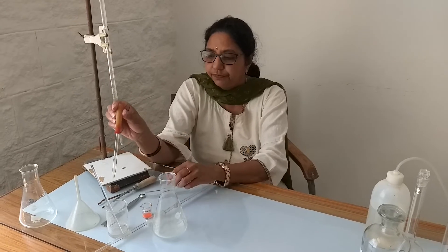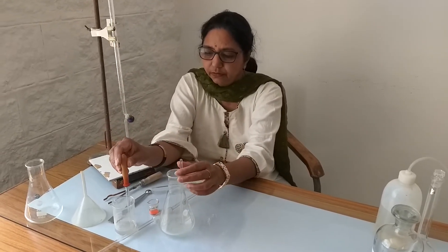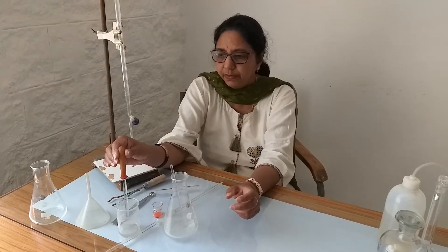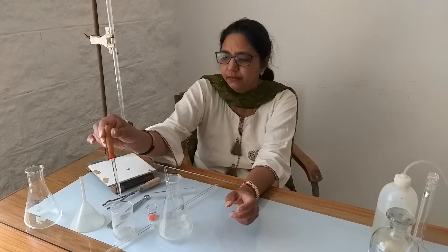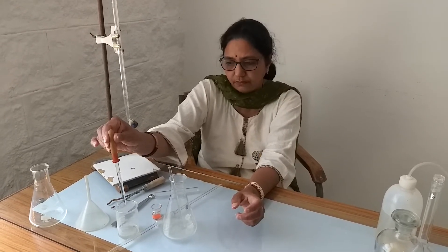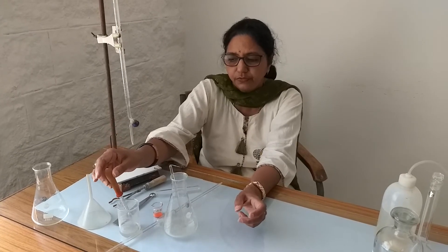This is a dropper. If we want to take a small amount of solution, we can simply press the rubber bulb on the top, take the solution, and then pour it slowly drop by drop into another apparatus. This is normally used for the introduction of an indicator.